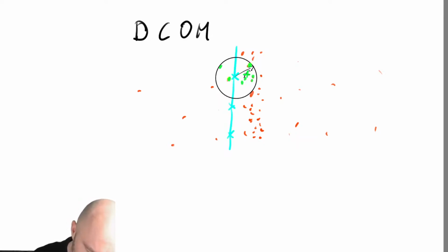the vertex, not to the center of mass, because you can imagine, if you've got a lot of atoms here and a lot of atoms here, then this one would move here, this one would move here, and then they would sit on top of each other. So that's not a good way of doing that. But what we're going to do is use the surface normal of our vertices. I'm going to show you in a second where you can find what the surface normals are. So I'm going to move it along the surface normal to that point.